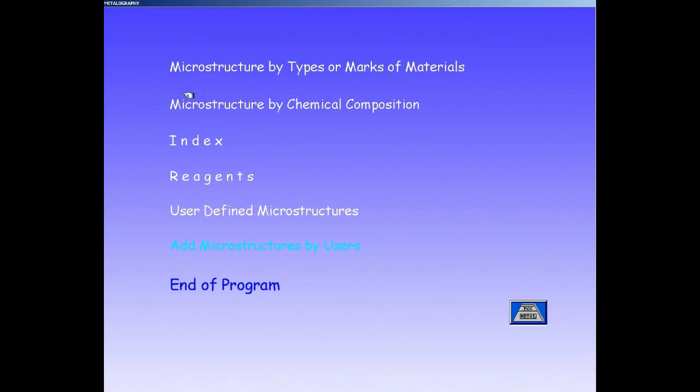By this, we have completed the examination of the program. I would like to thank you for your attention. This program considerably helps those who seriously deal with metallography, as well as helps students who would like to get some kind of orientation in this field. Where you may add and preserve custom microstructures, this program becomes a tool for different presentations.